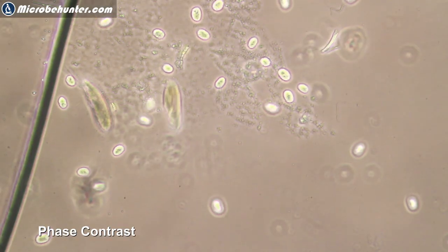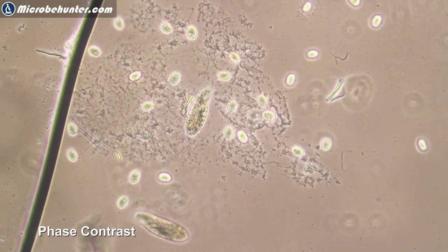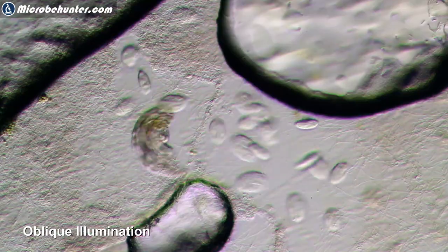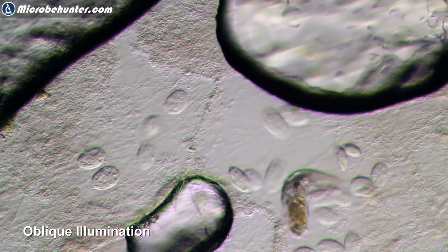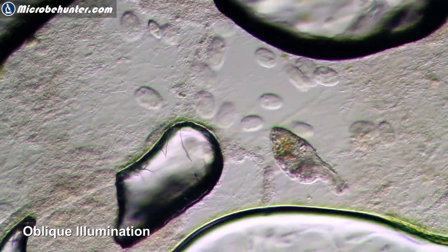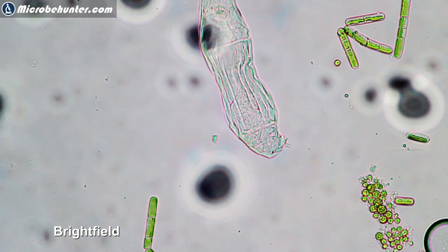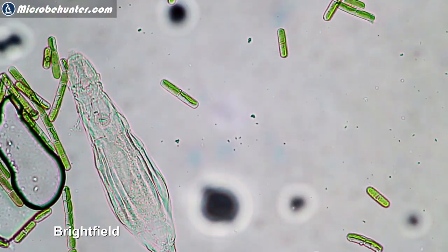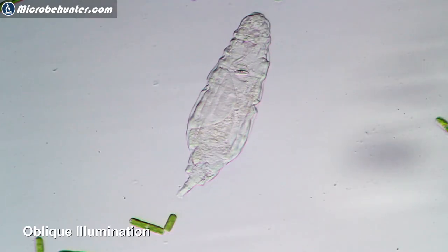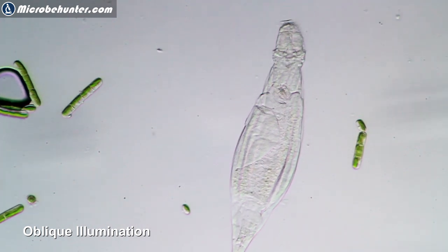Here is phase contrast showing paramecia and other ciliates floating around happily. And when you switch over to oblique illumination, you can see that the effect is also pretty good. So the question is: is it worth investing so much money in phase contrast equipment when you can get very good contrast using basically a piece of paper? Here again a rotifer in bright field is pretty transparent, but when we switch over to oblique illumination everything looks a little bit more cleaned up and quite nice.